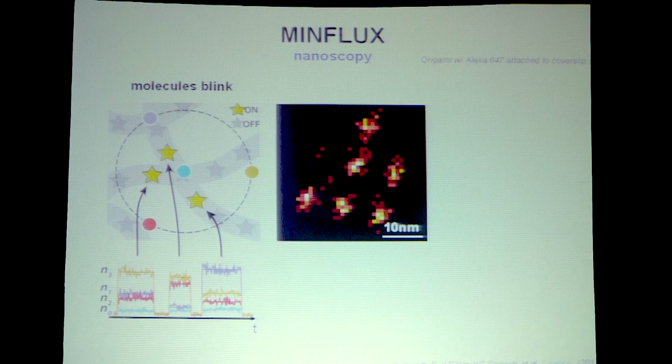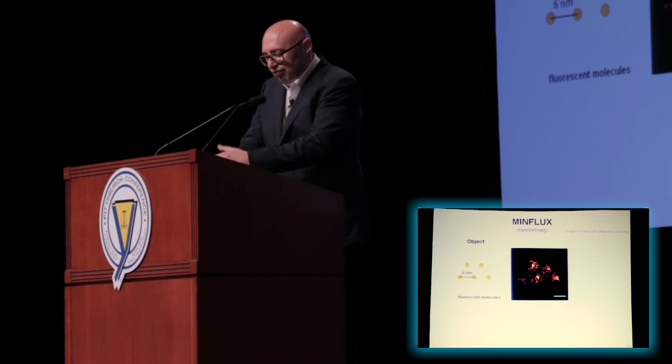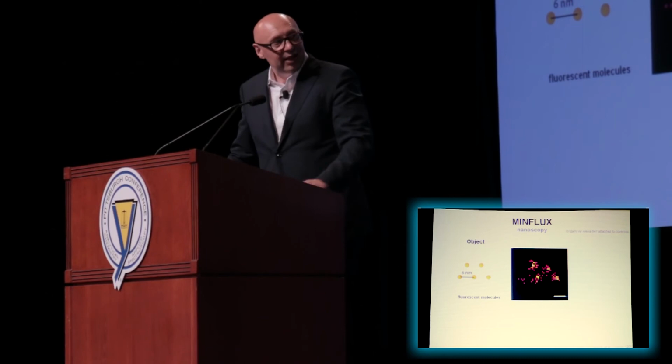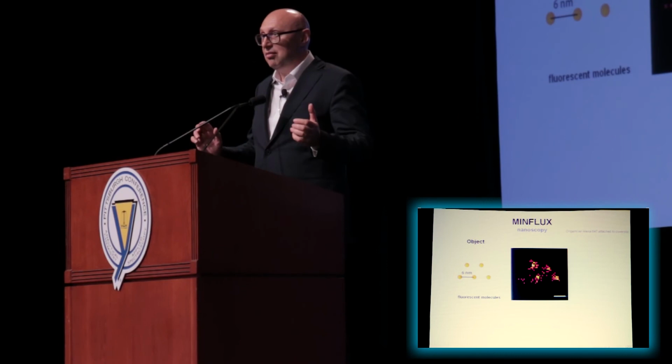Now, I like this picture very much because although it's not visually very arresting, these molecules are only 6 nanometers apart. So these are molecular distances, if you will, and you see them there on the screen. Now imagine 6 nanometers. That is 6 nanometers. So the diffraction barrier is 250 nanometers, probably about the size of the wall here.